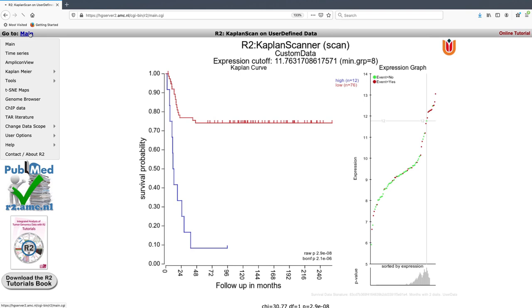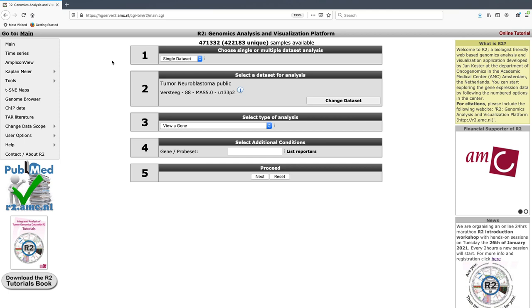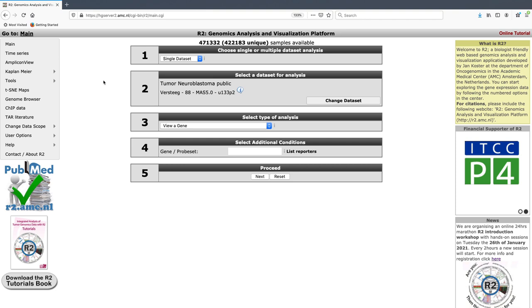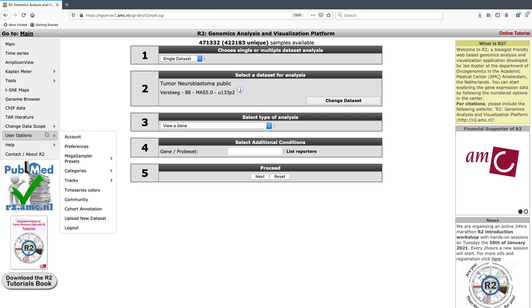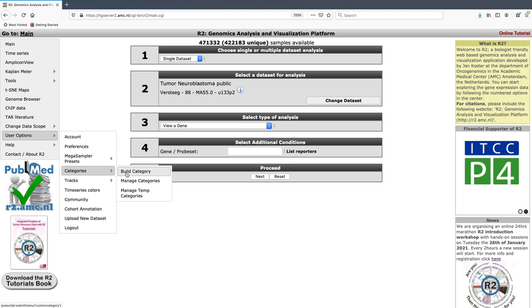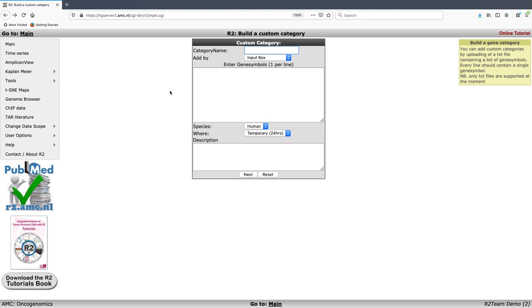Another example of how you can create your own data is to make your own gene sets or define your own genes of interest that you might want to make signature scores of. This is a common feature that users in R2 often use. From the main page, go to Categories and build a category - a category is a group of genes. Here we are presented with an input box where we can name our gene set and enter the gene symbols, either written into the input box one gene per line or uploaded as a text file.